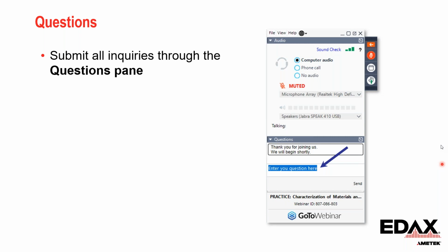This question is, can't other lines be used to correctly quantify in the EDS? Yes and no. Usually you have peak overlaps in EDS on the lower energy range, so you have the option to go to a higher energy range to get rid of those peak overlaps.